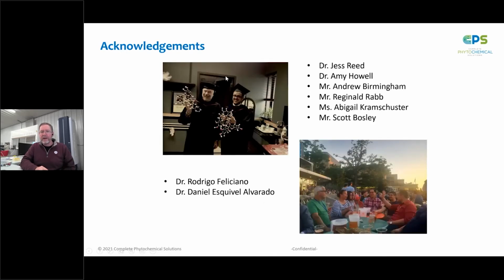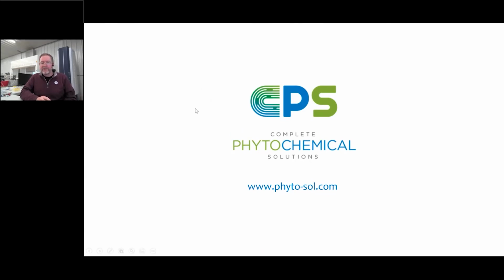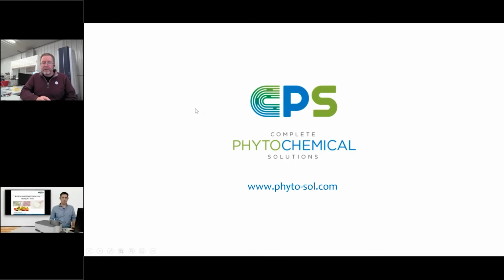I'd like to acknowledge my collaborators very quickly here. And then I would like to turn over this presentation to Chris Clark. Chris is an application scientist with Bruker Applied Spectroscopy Division here in Wisconsin. And he will discuss the use of NIR as a rapid method for quickly identifying adulterated food products. And so, Chris, I'm going to turn over the controls to you at this time.